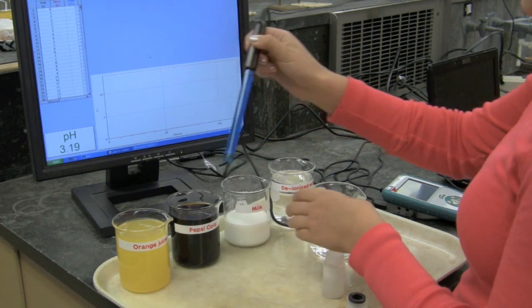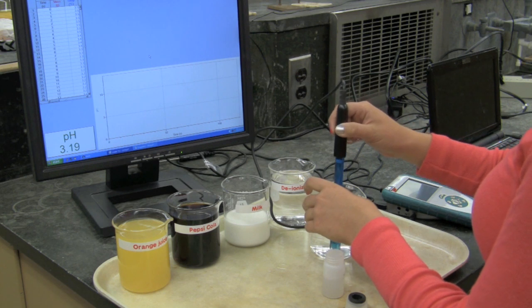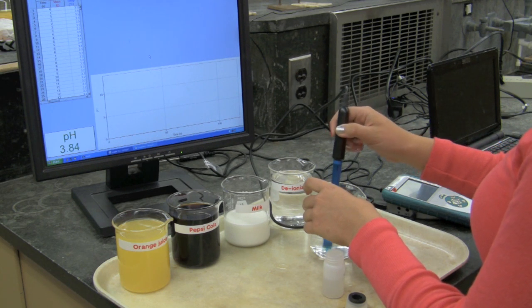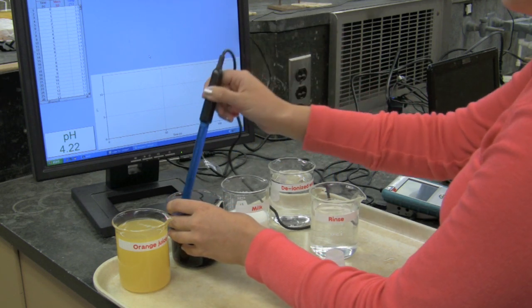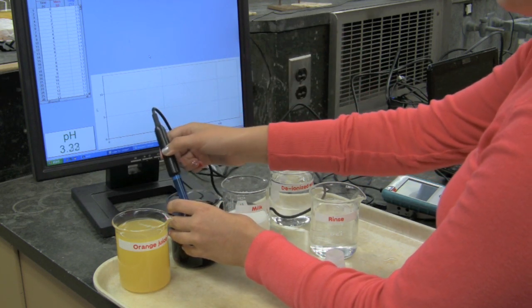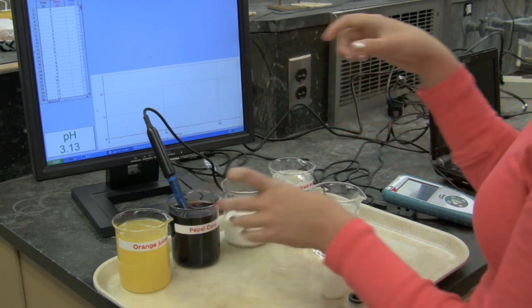She is removing the probe from the orange juice and placing it in a rinse. After a few seconds, she places the probe into a beaker of Pepsi-Cola directly to the right of the beaker of orange juice.